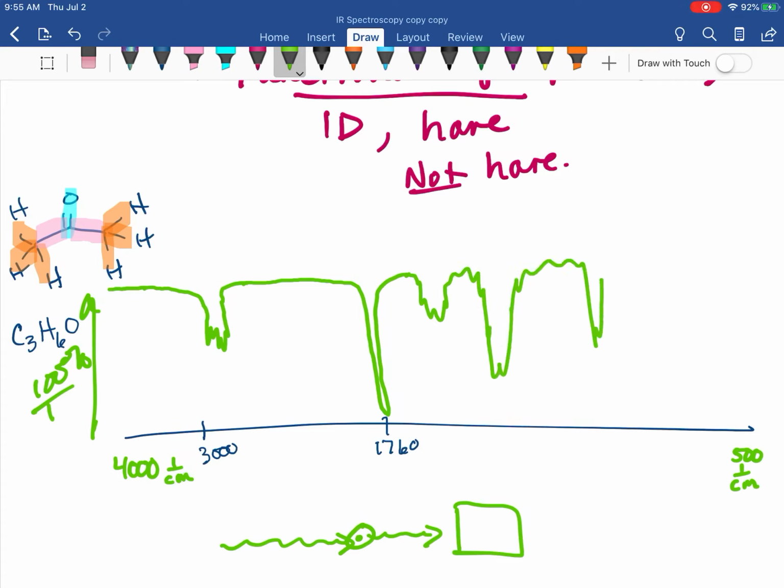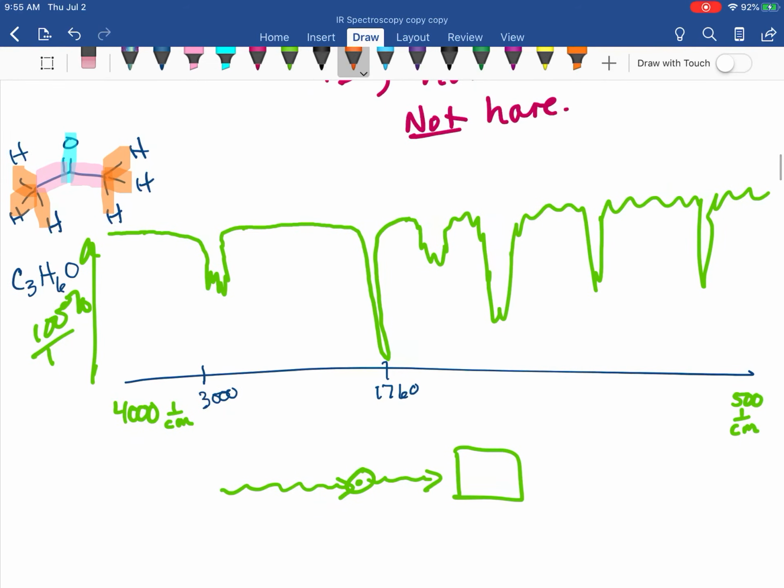And then we start seeing some peaks in here. And maybe it gets just a little bit sassy down here in this range after that. And you're wondering, okay, wait a second. Okay, the shoe just dropped. Cliffhanger number 1. Why aren't there 3 peaks? There are more than 3 peaks. And why does it get complicated down here?